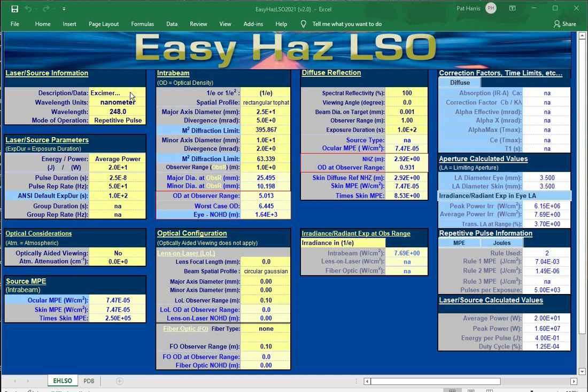This wavelength is used, for example, in cutting holes in catheters, also processing Kapton in the electronic industry, and that's because this laser uses an ablation process, so there's very little residual heating, and there's no cleaning up to do after processing those materials. So instead of using a heating process where we move from a liquid to a vapor state, it's a much cleaner process for cutting those materials.